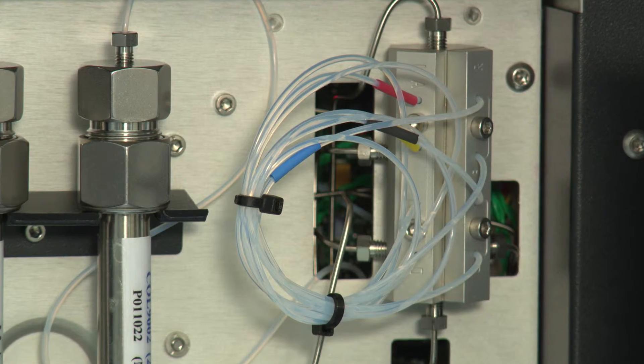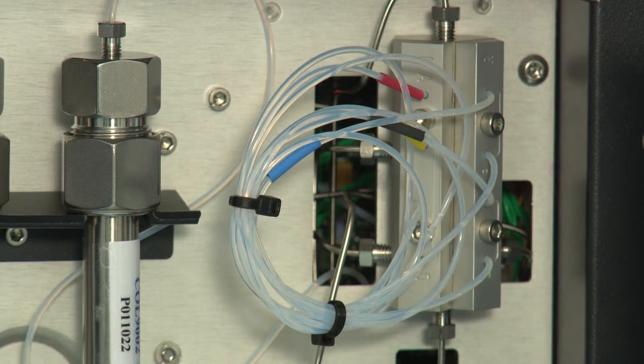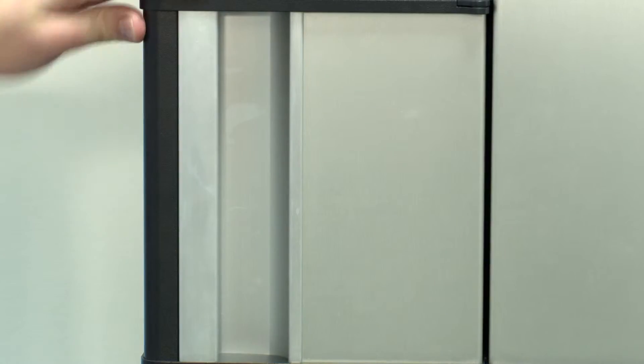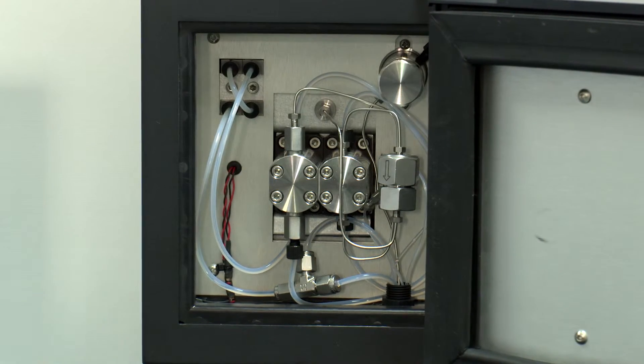So how have we made Omnisec more user friendly? It has a newly designed self-balancing viscometer with user-exchangeable capillary bridge, and the temperature-controlled autosampler can inject low volumes from vials or 96-well plates with no sample waste. The low volume degasser and self-priming pump make mobile phase changes a breeze.